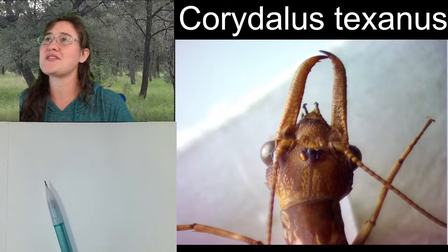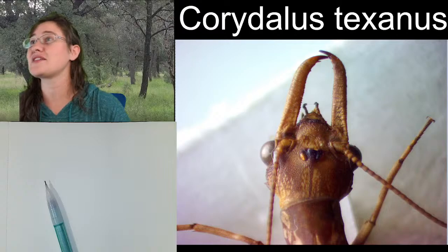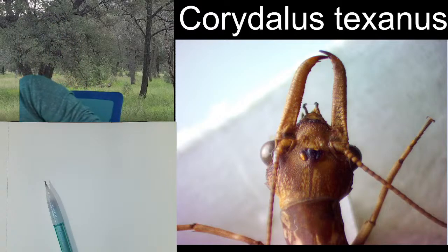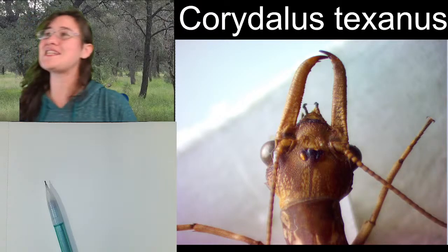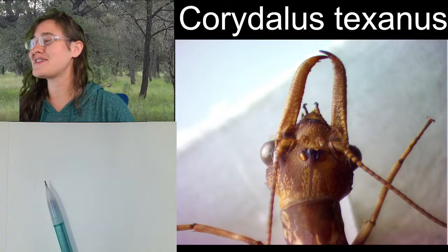And that is the western Dobsonfly. This individual was collected in Arizona in 2009. So it's one of my older specimens.